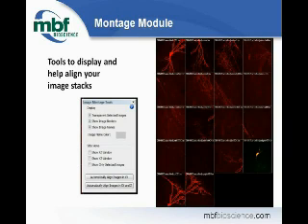Anybody that's reconstructed neurons from a set of image stacks knows how hard it can be. Older versions of Neurolucida and Stereo Investigator provided tools for these adjustments, but as demand and image data increased, so did the need for tools tailored for this task.